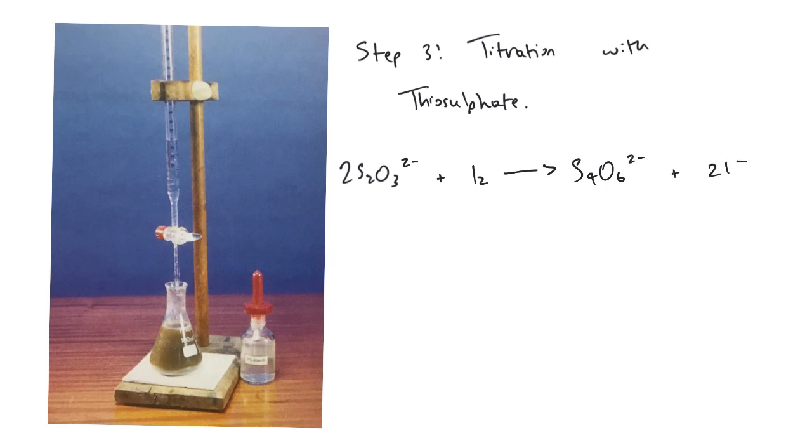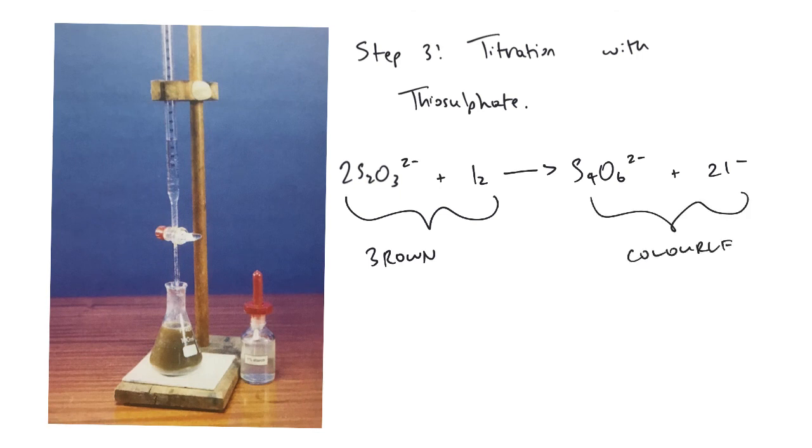And the key thing about these is that we've got a brown mixture on this side and we've got a colourless mixture on this side.